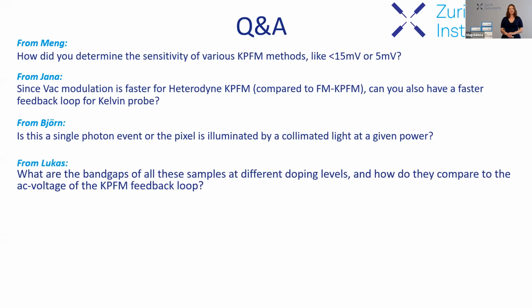Cool. Okay. Thanks. And we have another question from Lucas. What are the band gaps of all these samples at different doping levels? And how do they compare to the AC voltage of the KPFM feedback loop? We didn't change the doping level. We use only one semiconductor with the same doping level. So I don't quite understand the question. No, that's fine. That's okay. We can come back to this question later and maybe clarify what was meant. But thank you for the input.